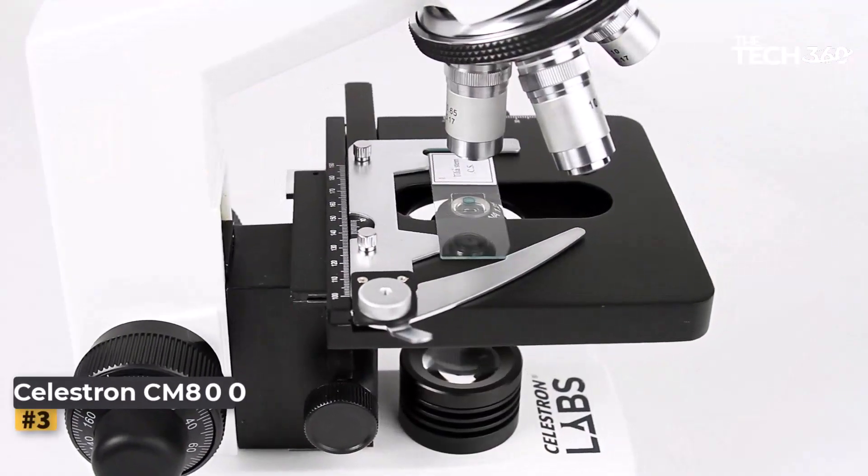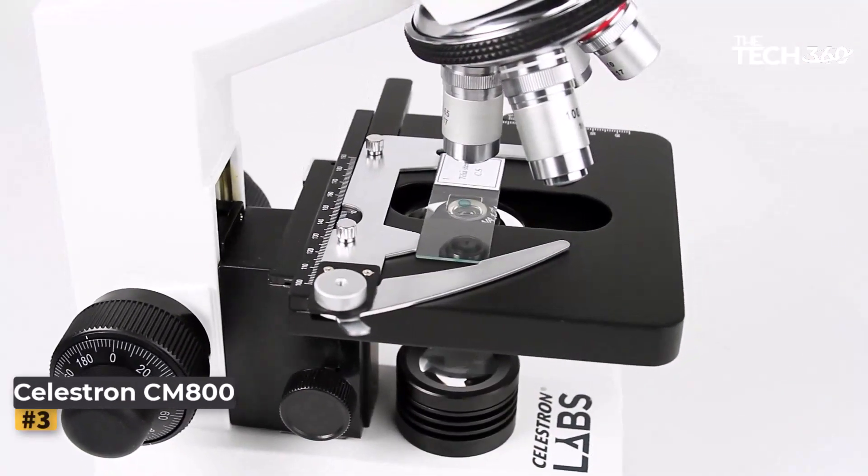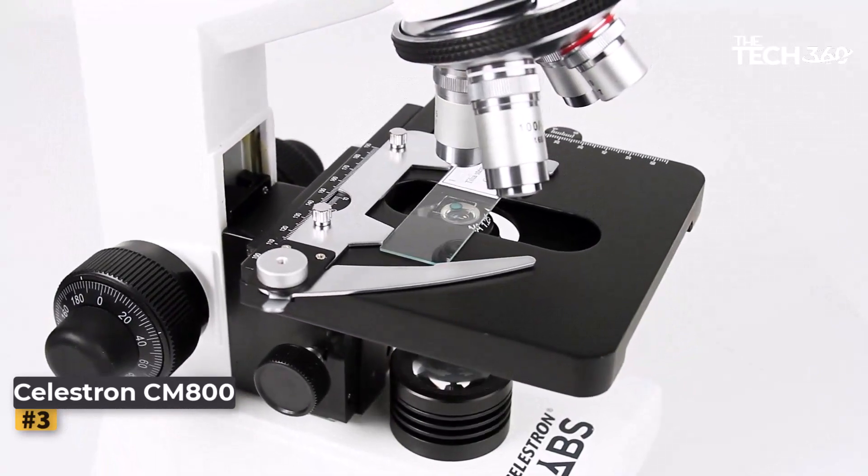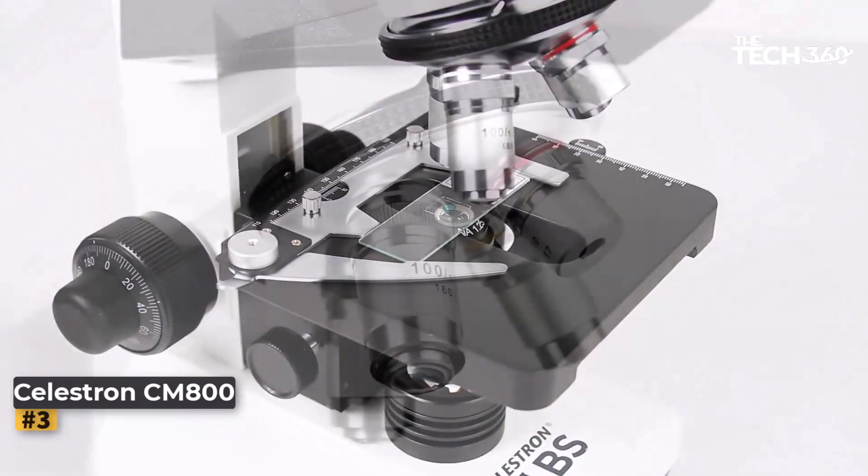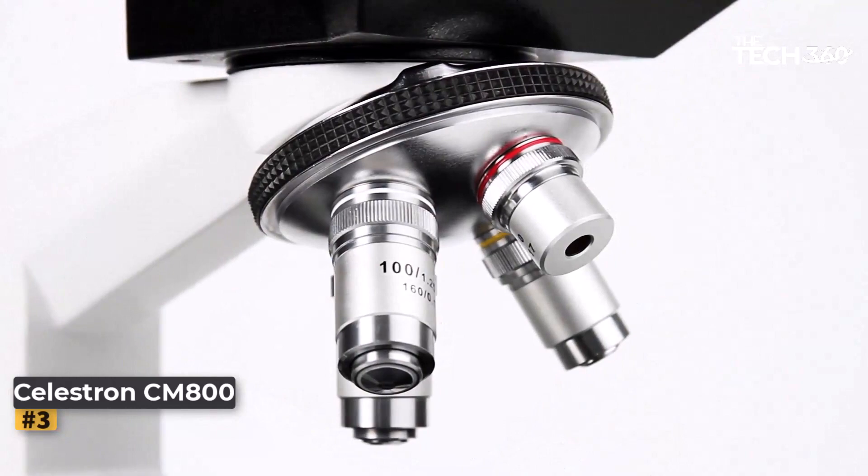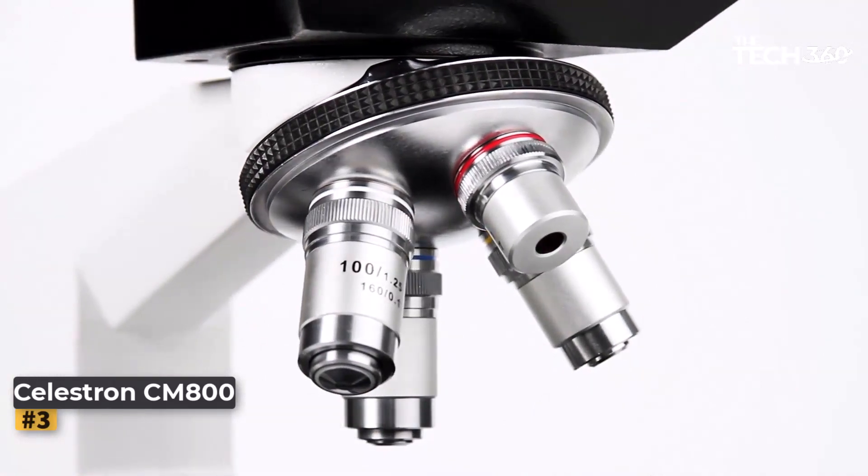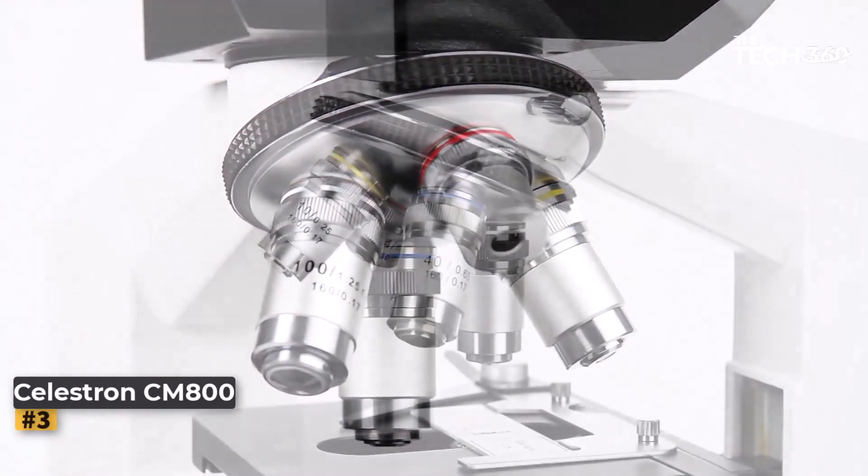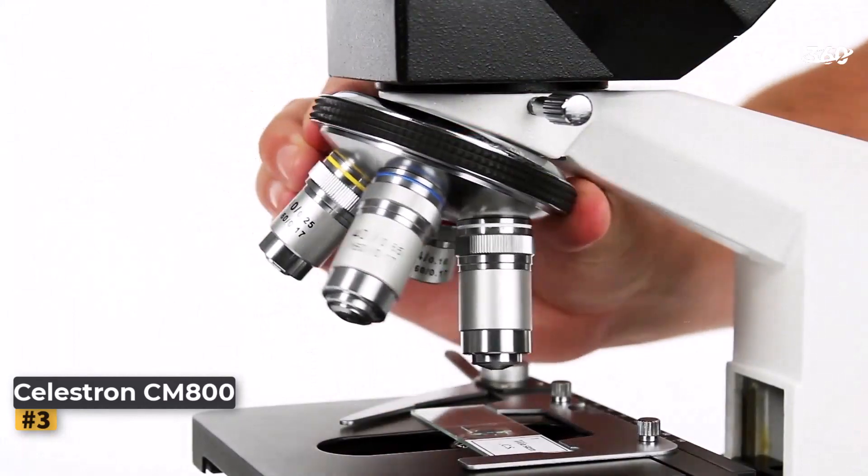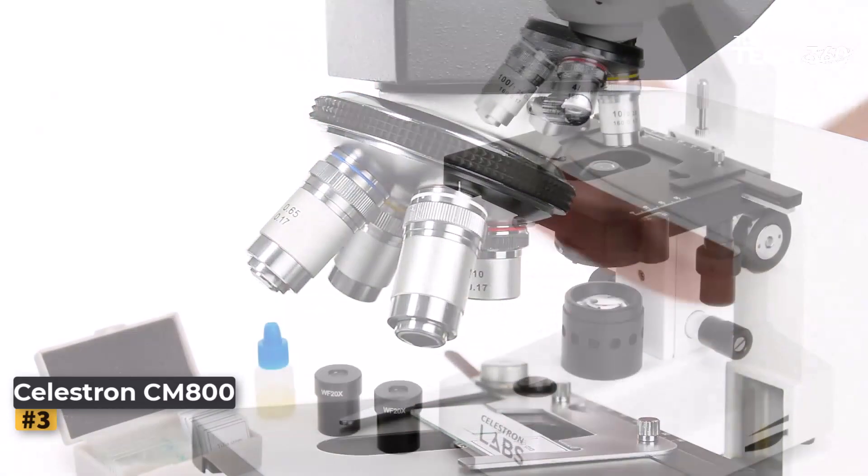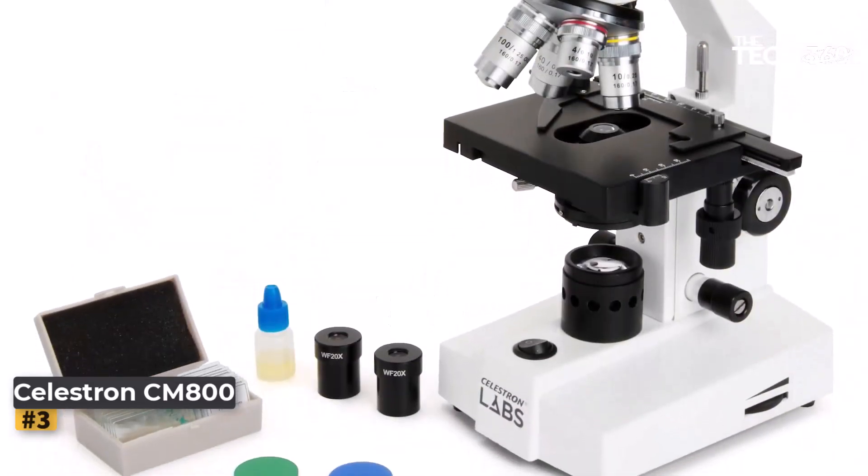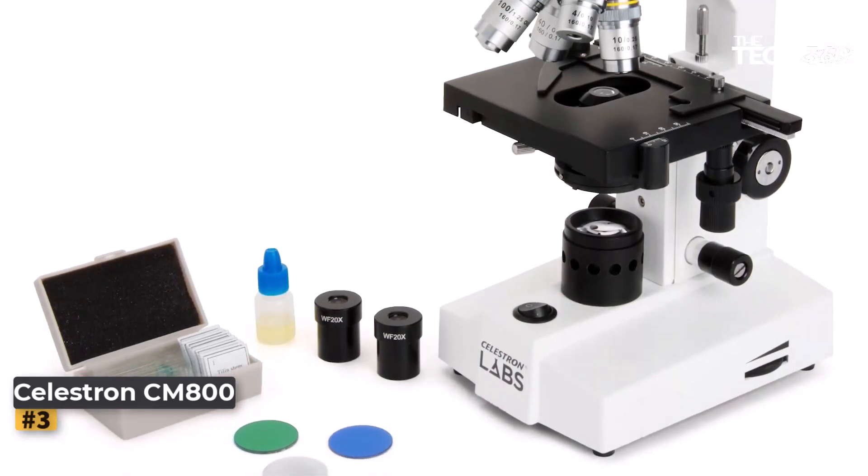Number 3: Celestron CM800 Compound Microscope. The Celestron CM800 Compound Microscope is an affordable option marketed as lab-grade. It is an excellent choice for college and university students. With a sturdy all-metal build, two eyepieces, and three objective lenses, this microscope offers magnifications from 40X to an impressive 800X.